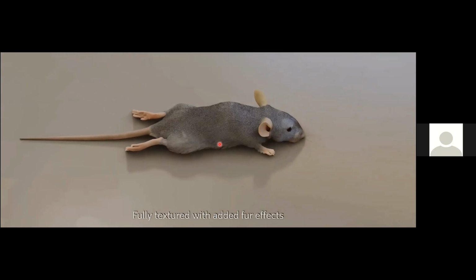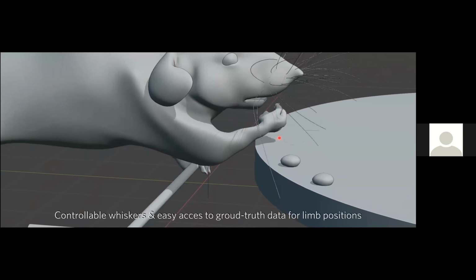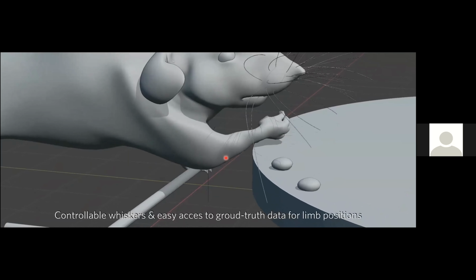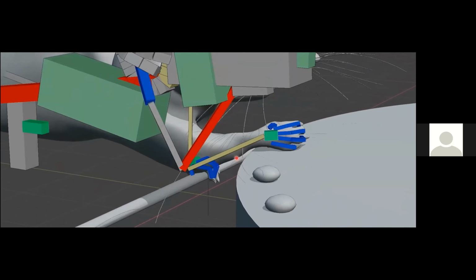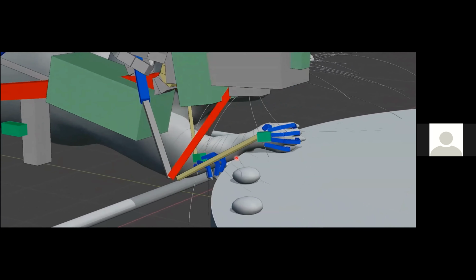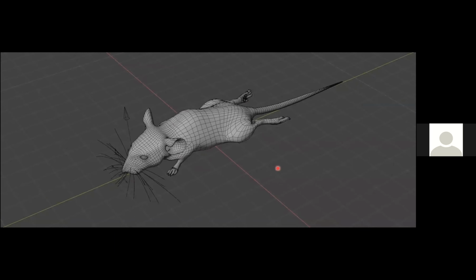If you want to generate the movement, we only need to click on the body parts you want to control and drag them to the position you want. During the simulation, we can also introduce additional diversity by varying the camera position, camera angle, lighting, and the surrounding experiment devices.